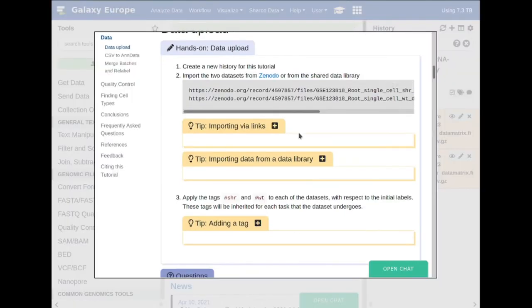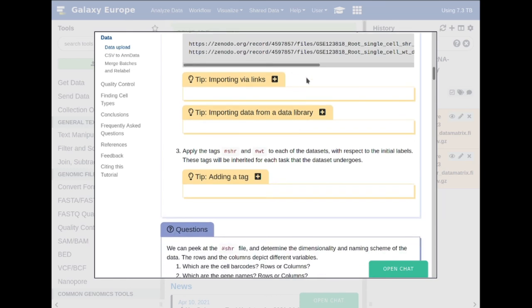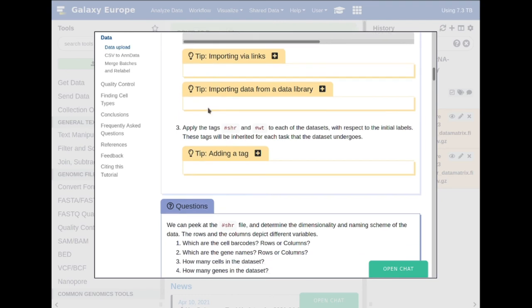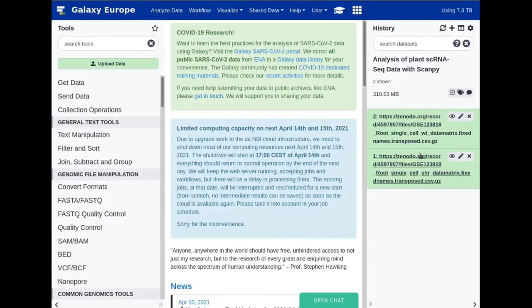Once the datasets are orange, we can begin to apply tags to them. Tags in Galaxy are a way to assign a dataset some kind of label that tells you more information about it and about whether the data you have processed originated from a certain input. The way to propagate these tags — so that the output of a given tool shares the same tag as the input — is to put a hash symbol just before it. These hashes are very important. We should apply the 'short root' tag and the 'wild type' tag to each dataset with respect to their initial labels.